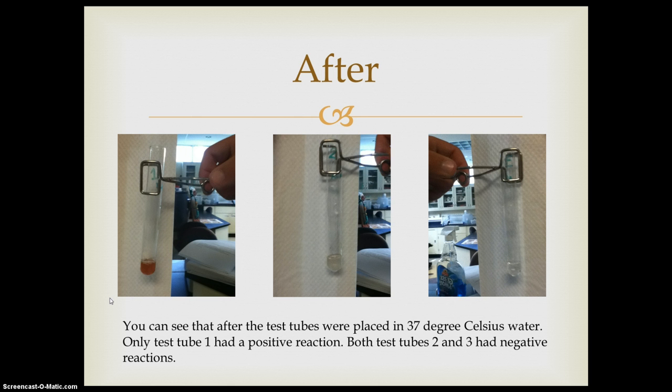After. You can see, after the test tubes were placed in 37 degrees Celsius water, only test tube one had a positive reaction, while test tubes two and three had negative reactions, and you can see it right here. Test tube one, test tube two, and test tube three.